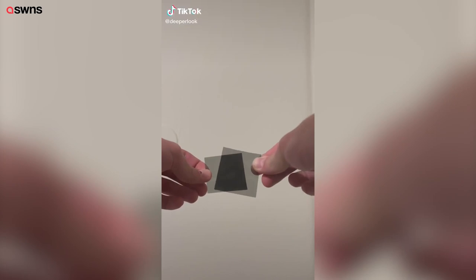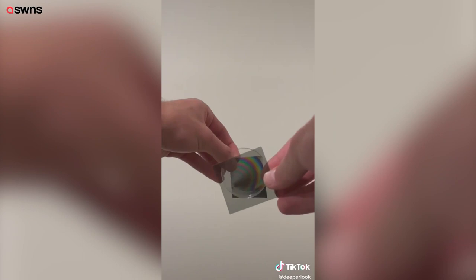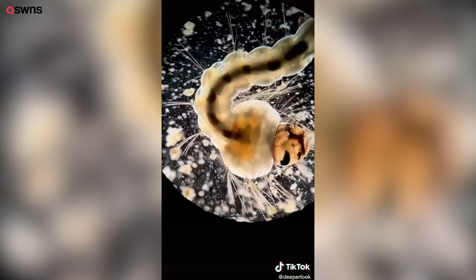If you take two sheets of polarized film and hold them perpendicular to each other, they'll block out almost all the light. But if you put something between them that changes the polarity of the light, you can see those changes.